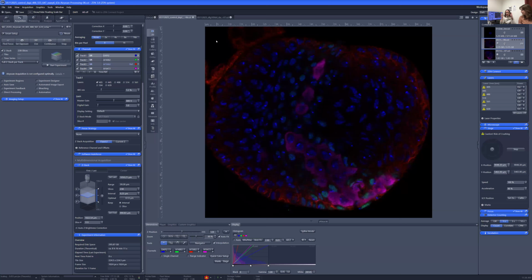The term that we use is that I've knocked down the expression of this gene. And basically what I'm looking to see is if getting rid of the expression of one of these genes changes the number of egg stem cells. And so I'm going to show you on the screen now, these are images that I took 2 weeks ago that showed a really, really nice phenotype, a really nice example of what it looks like when changing a gene results in more egg stem cells.